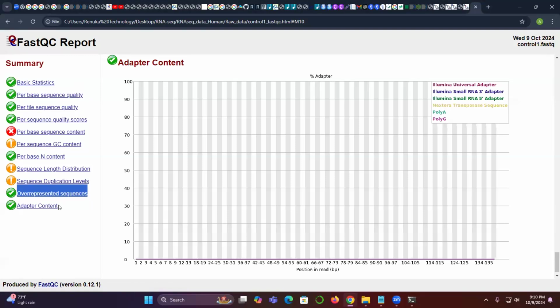Okay, so your data is good, but I will tell you how to run the command for Cutadapt. So that in future, if you are getting bad data, you should know how to remove that sequence. Okay, so I will give you the commands tomorrow. Clear? Okay, ma'am. Yeah. So we'll end here.